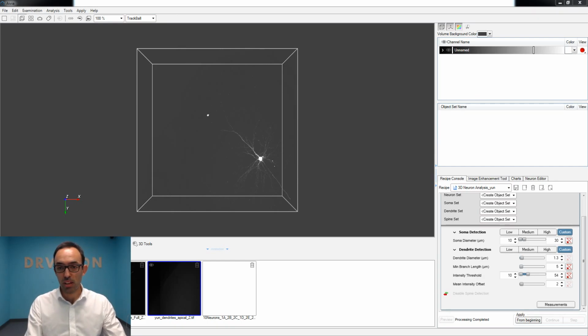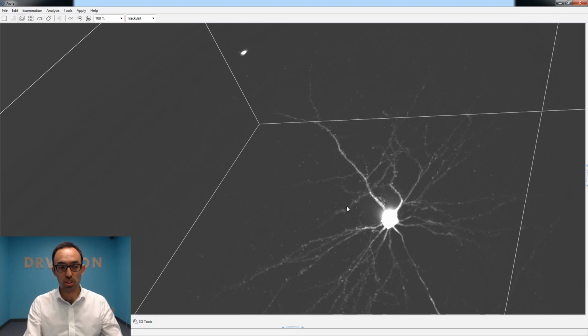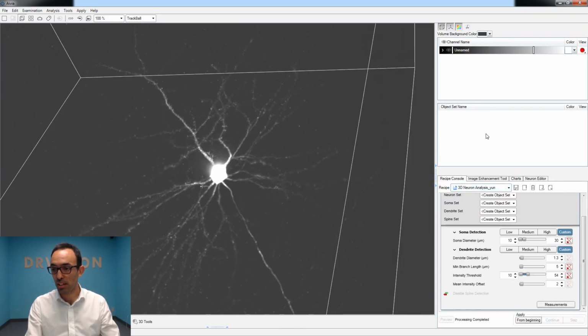All right. Hopefully you will be able to see it. It's in the mode very much the same as what you saw in the PowerPoint a moment ago. This panel on the bottom is collapsible, as is the one on the right hand side. And that's very useful when you already have the results and you want to explore them on your flat screen. So you have more space to look at the results. That's why we have it this way, so you can collapse everything.